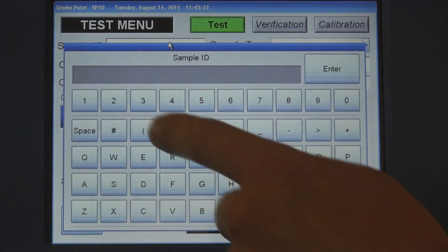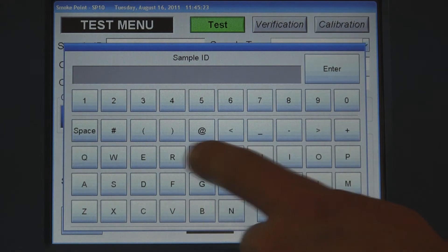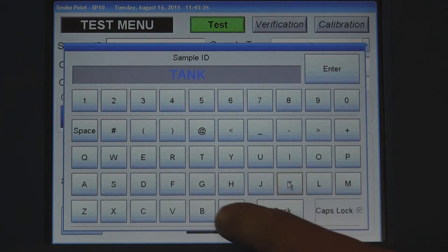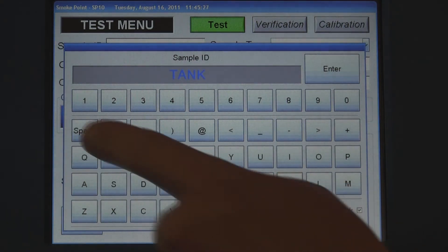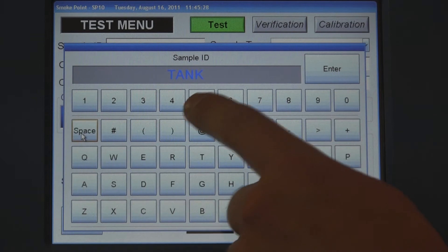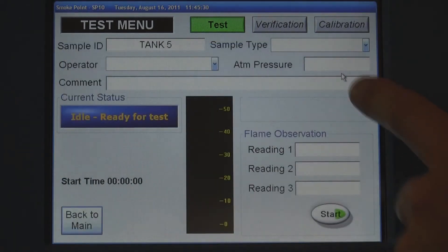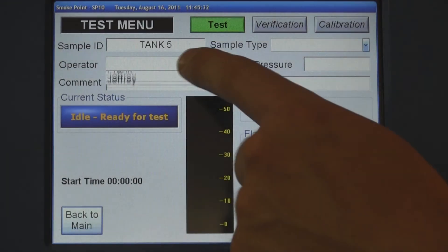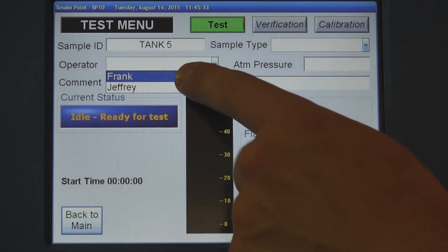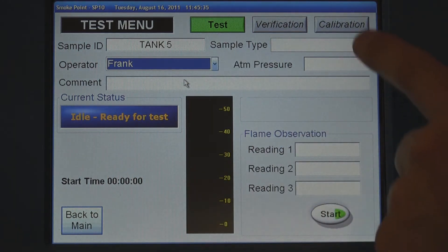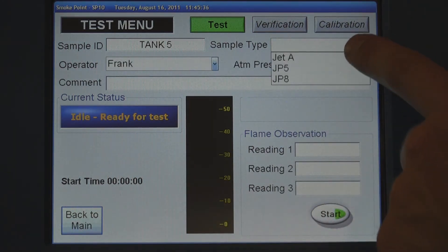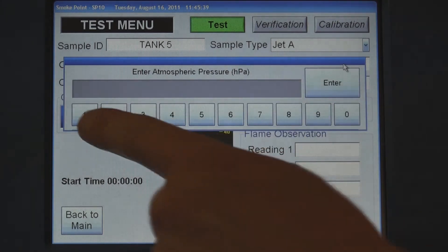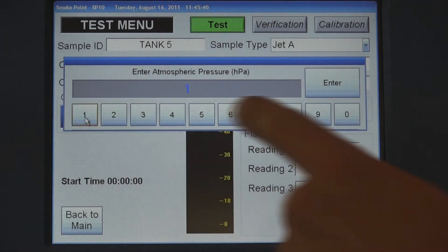Enter the sample ID, select the operator name, select the sample type, and enter the barometric pressure.